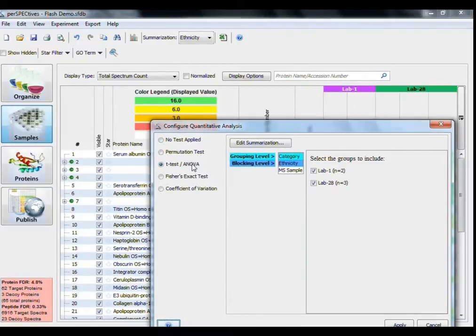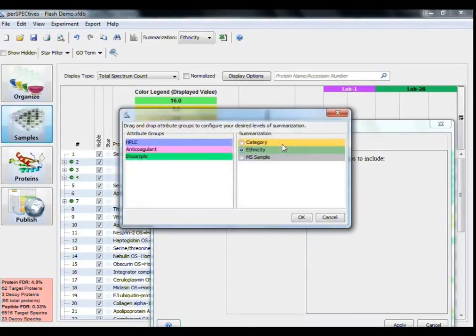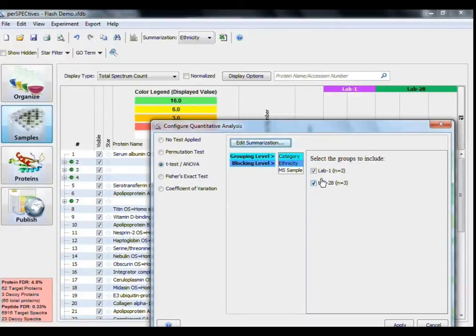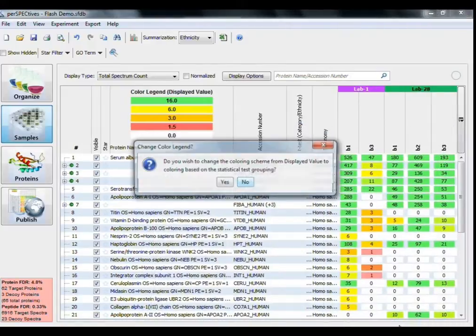Which will bring up the option to change the summarization of the experiment before applying the test by using the same drag-and-drop method as before. Note that the statistical tests perform the calculation based on attributes in an attribute group, not attribute groups themselves. Click Apply to start the test.